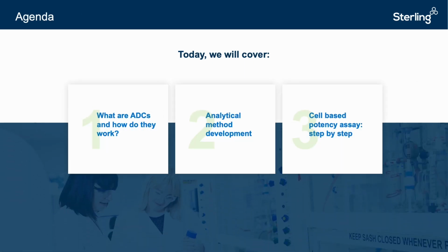The webinar is divided into three parts. Initially, I will give a brief introduction of ADCs and how they work. Then Martin will talk you through our analytical method development program. And finally, I will take you through a cell-based potency assay we have developed and validated.